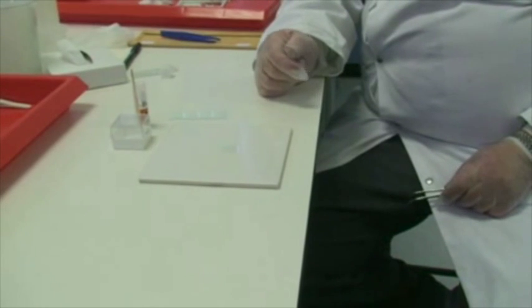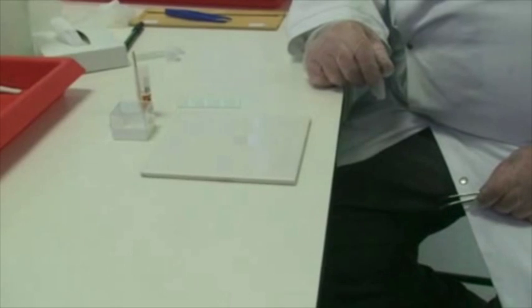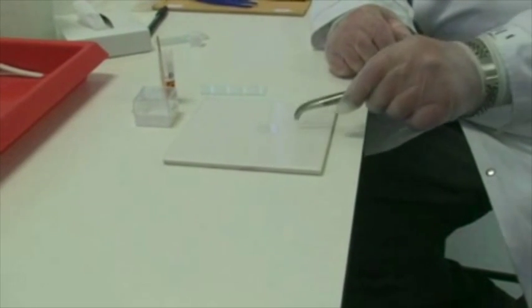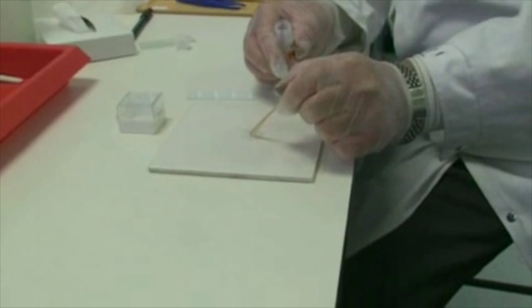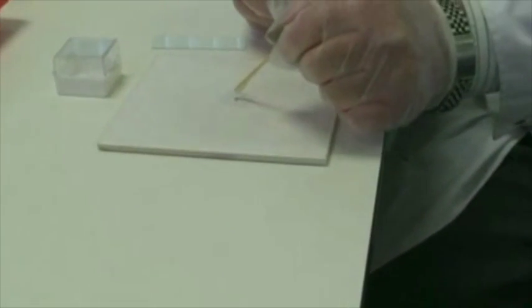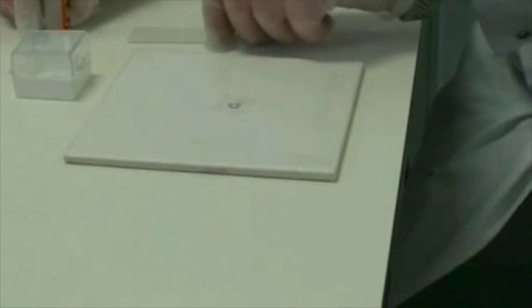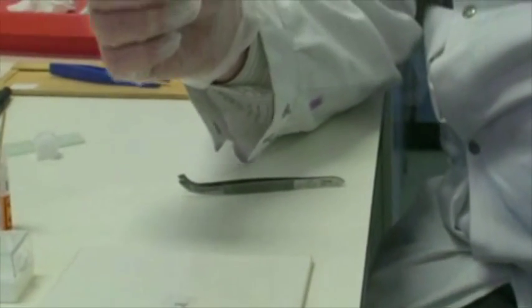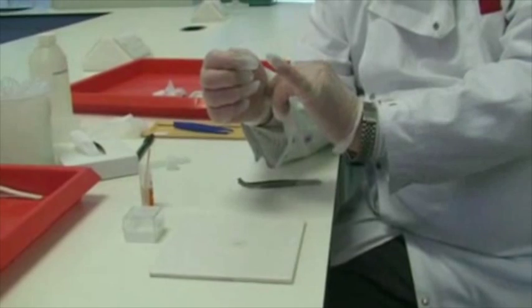I'm now going to do a quick demonstration using a plain blank slide of the next step in the procedure. I've already placed a glass cover slip onto the tile and I'm now going to add two or three drops of resinous mounting media. I'm now ready to take the slide. In the final process, on this side of the slide we will have our tissue.